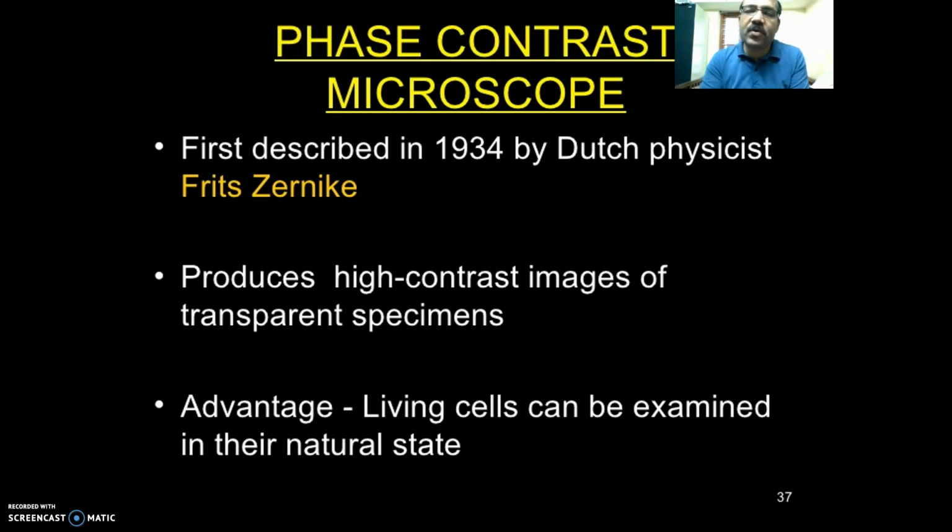But in the case of phase contrast microscope, we can observe the movement of a particular microorganelle, movement of a particular part or activity of a particular organ. In the case of animals, in the case of plants, we can observe different aspects as far as the cell is concerned, as far as our objective and concept is concerned.